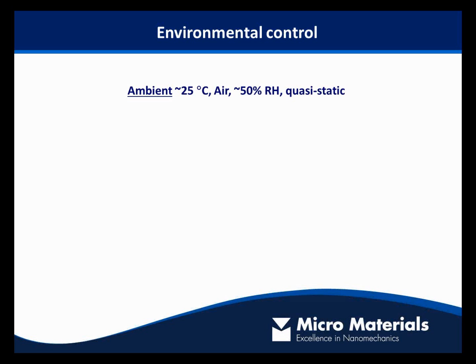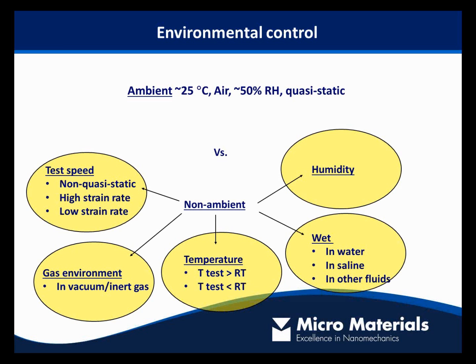But we might also be interested to understand information in non-ambient conditions, where potentially we might want to go to high or low strain rate, in non-quasi-static or dynamic conditions. We might want to change the gas environment we do the test in. We might like to look at the mechanical properties as a function of temperature, either above or below ambient temperature, to study the effect of moisture with change of humidity in the test chamber, or even to fully immerse the samples in water, saline or engine oil for a tribological application.